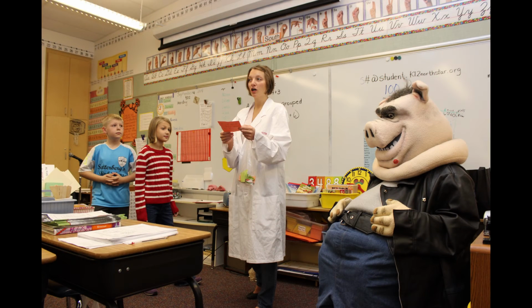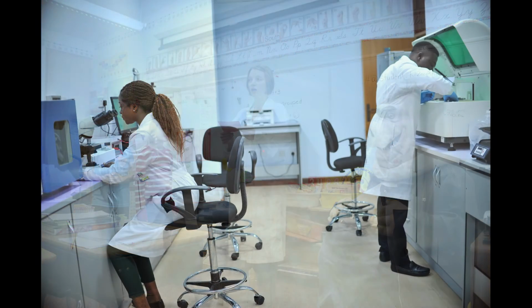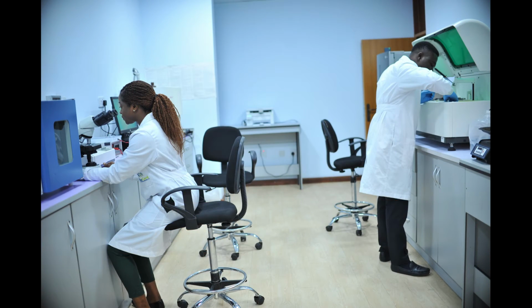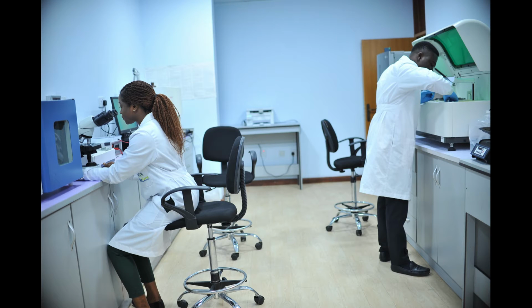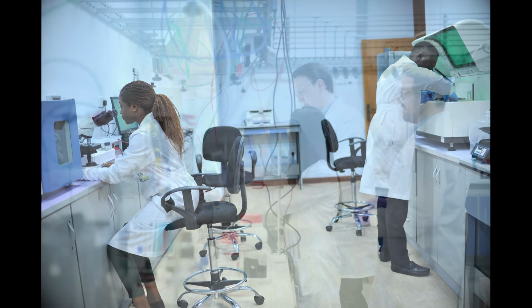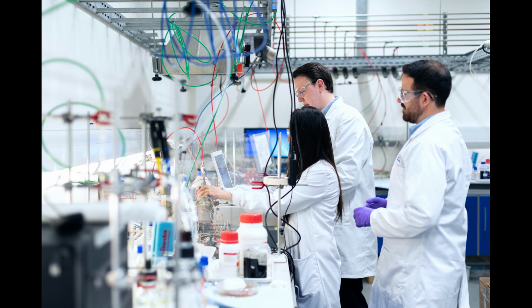In other instances, it can be used in teaching facilities such as universities and colleges. In most instances, whatever you're dealing with isn't going to be particularly dangerous. There are a range of standard laboratory practices. Most of this is fairly straightforward. Things like don't lick the surfaces, don't drink in the laboratory, clean up after yourself, and similar. But nearly all the work can be done on an open lab bench as there's almost no risk of any kind of spread, so long as you're wearing appropriate PPE. Generally something like a lab coat, gloves, and eye protection.